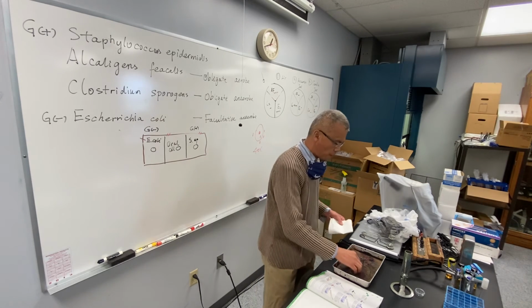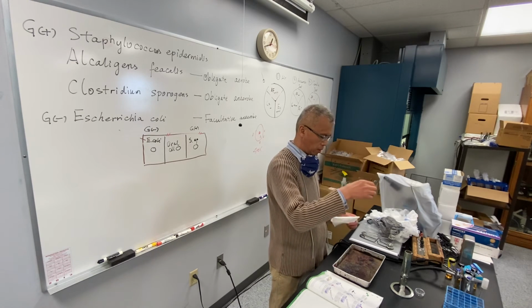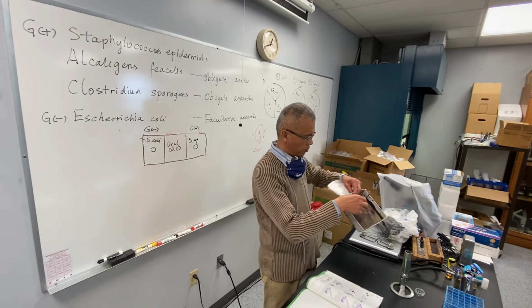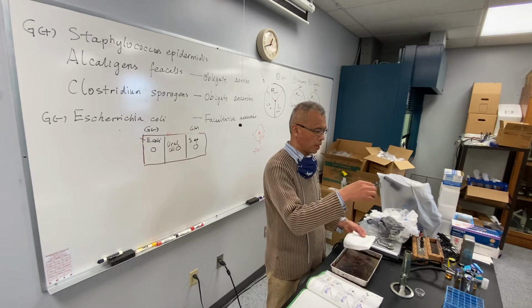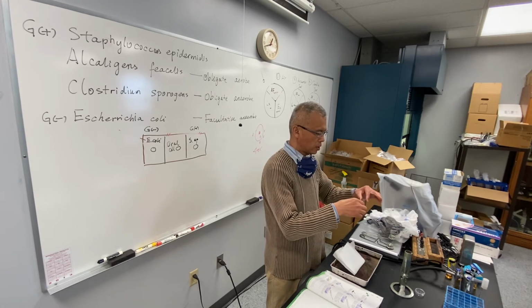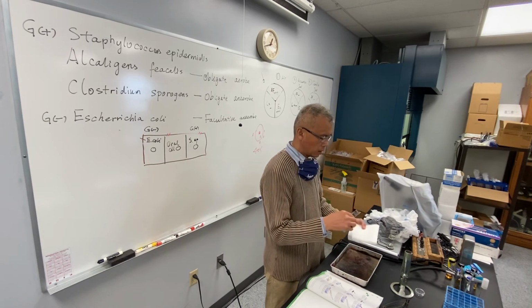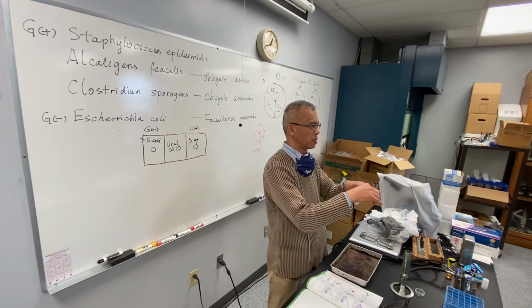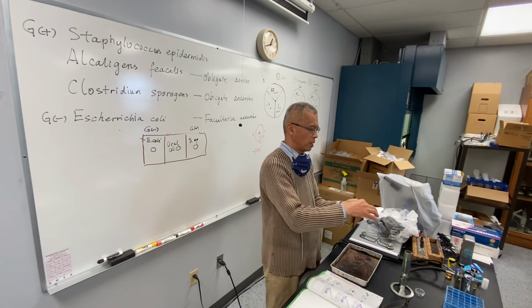You can operate the whole thing with this slide clip, so you stay away from the surface of the tray. The floor of the tray is very dirty. And the last step, when you're done, you remove your slide and place it on the paper towel face up, so the cells are on this side. Don't do it this way, right? On top with the face up position.